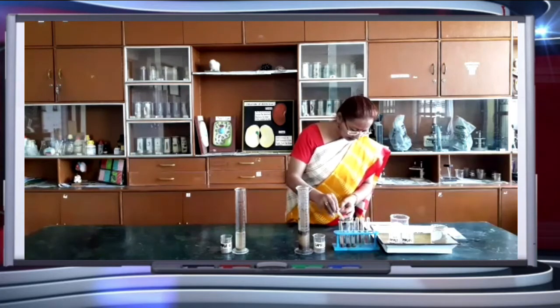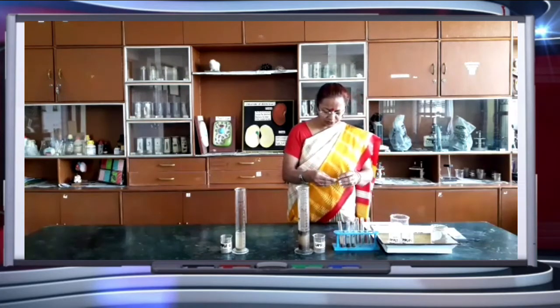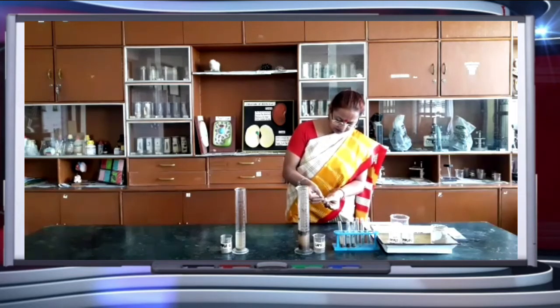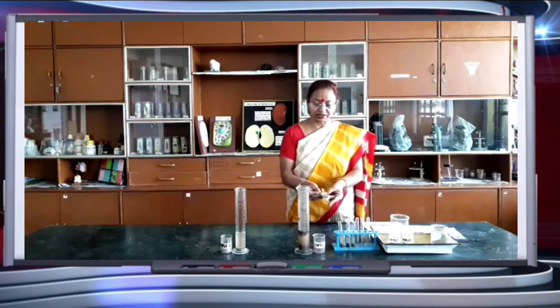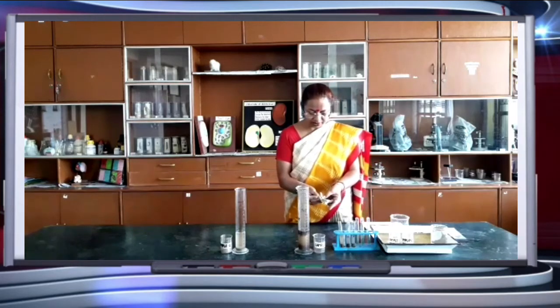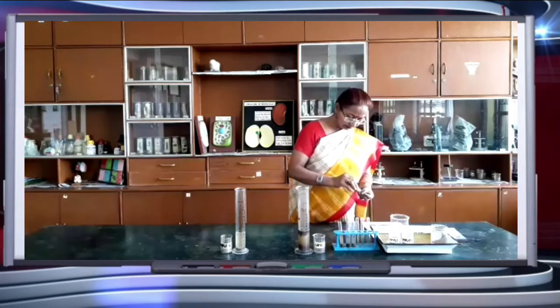It is slightly green, which you can easily match with the 8. So the sample 1 shows pH 8. Basic. It is towards the basic, slightly alkaline in nature. Now the other sample.